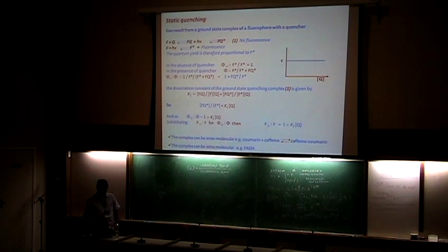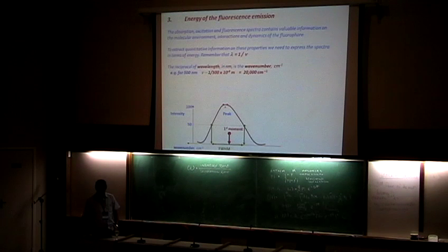Of course, as I mentioned, you have to be careful with static quenching, because that is not an excited state reaction, so it does not change the lifetime.